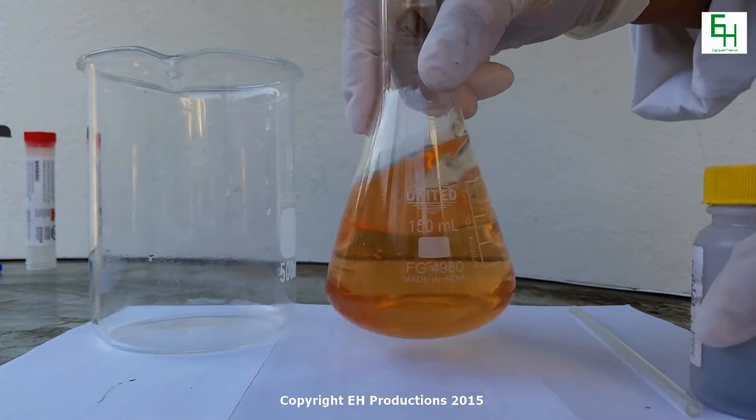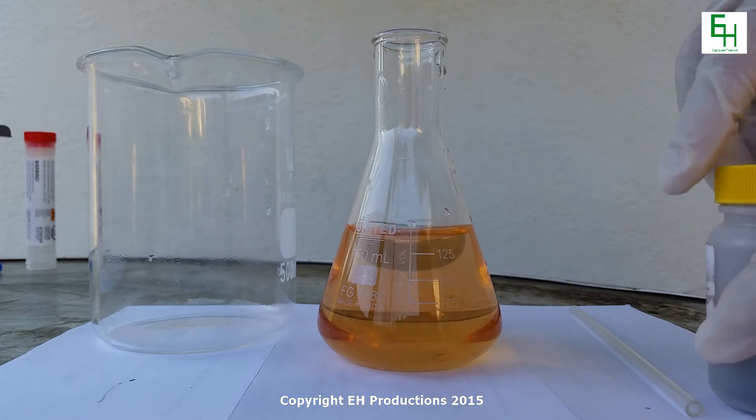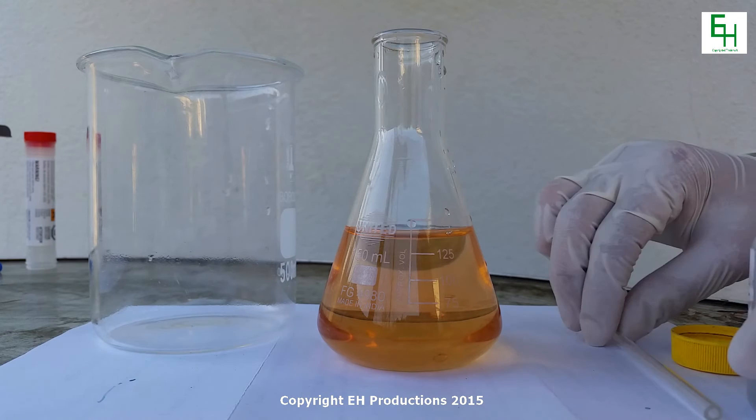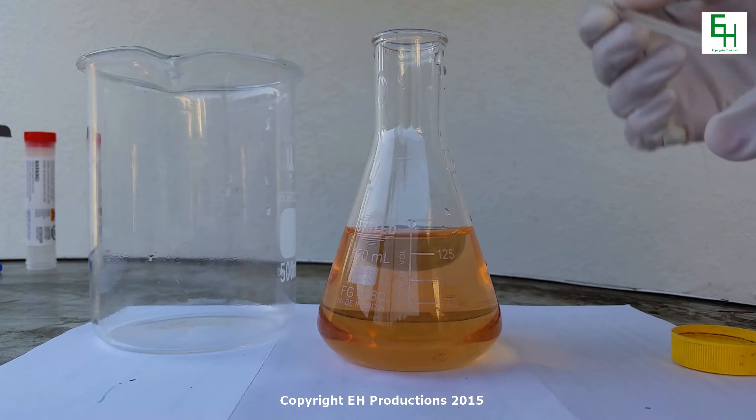I think that's the last phase the colors are going to change into. Yep, I think that's all. So I'm gonna see what happens if we add some more potassium permanganate into the solution.